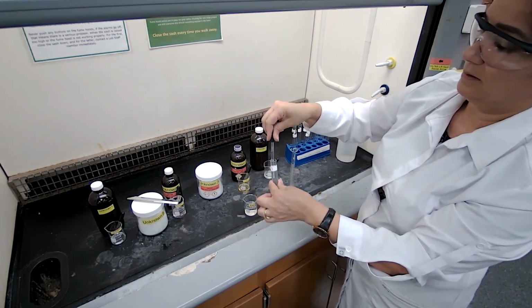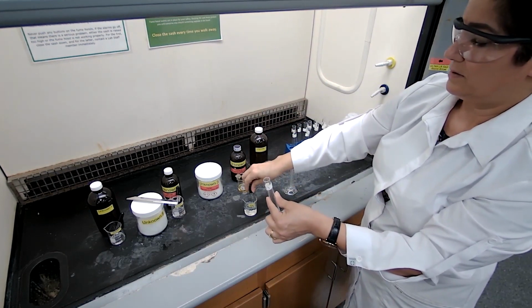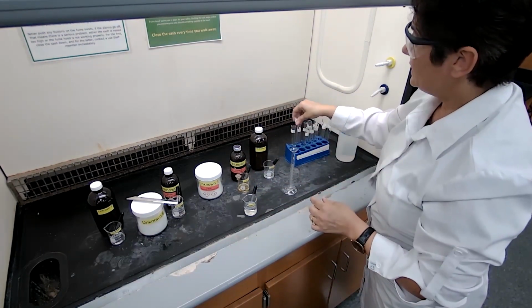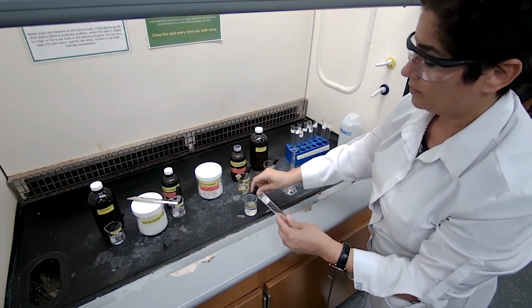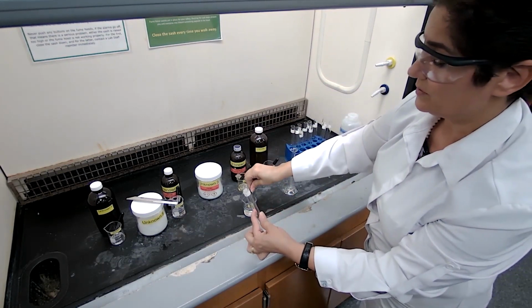1, 2, and 3 full droppers. Now, is this compound soluble? Let me finish it all and then I will show you if it's soluble or not. Add the 3 milliliters to each of the test tubes.